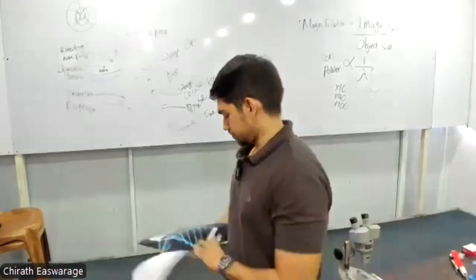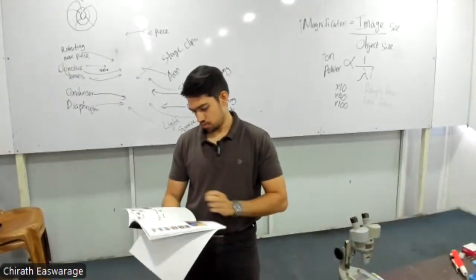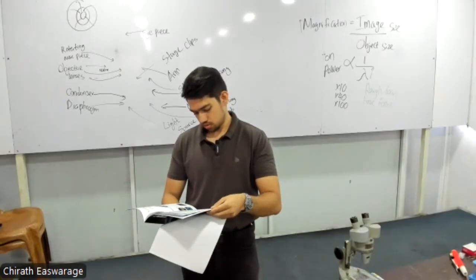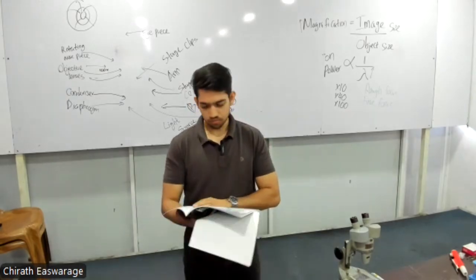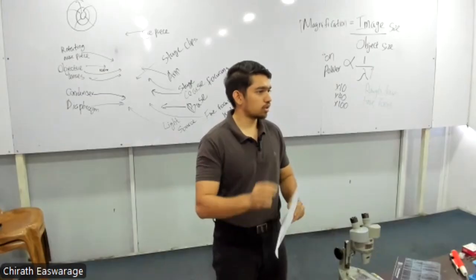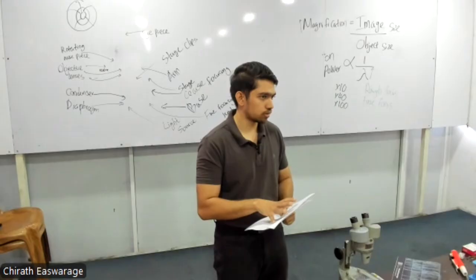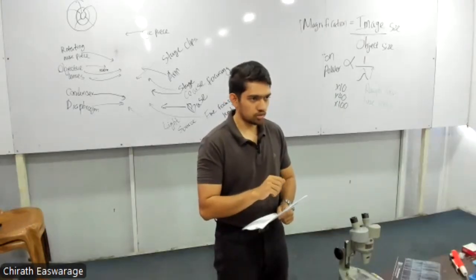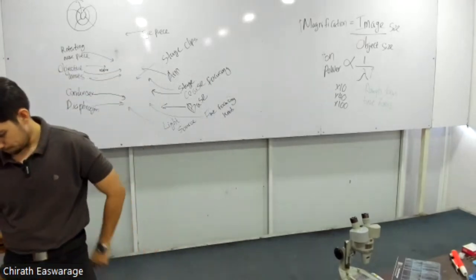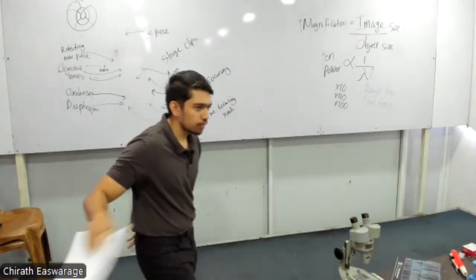In the main tute, under the questions that we have about microscopes, oh, no, it's not there. Sorry. Anyway, it can be questioned in the structure. They ask for the series of steps that you need to follow to do this practical properly. There is the observation of onion epidermis. Let's write down the steps. Any question? No?